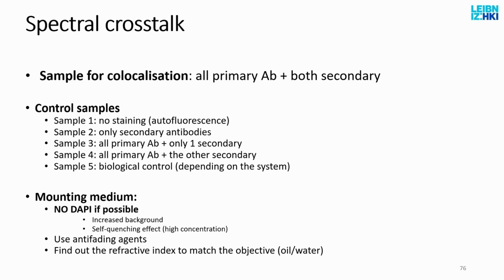I wanted to talk a little bit about this one. I don't have a slide, unfortunately, but you will understand me. Should I use an oil objective? Should I use a water objective? Should I use a glycerol objective? Well, it depends on the light path, and how deep you have to focus into the sample to get the area that you want to find.